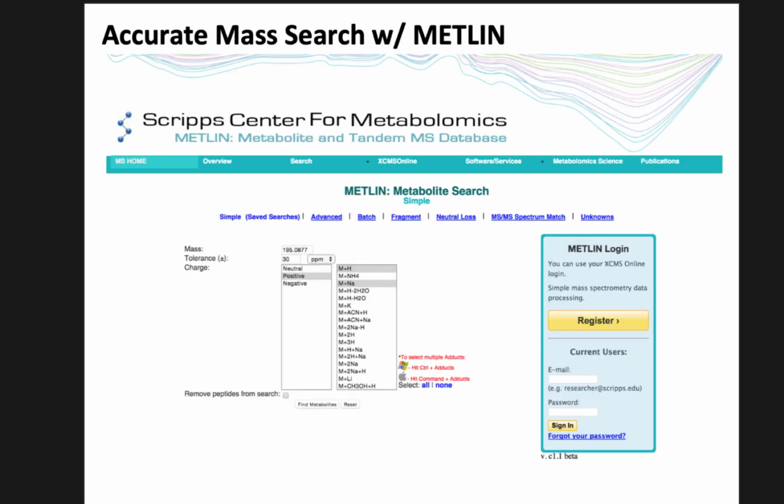If you try that with Metlin, then again, we would input just the mass. We would input the tolerance. Where do you get this tolerance from? Yeah, that is what you would know about your instrument, hopefully. And what happens if you make this tolerance too narrow? Well, then you will just miss candidates. So this value should be realistic. What happens if you make it too wide, if you're too cautious about it? Then you will end up with thousands of candidates that you can't do anything with.